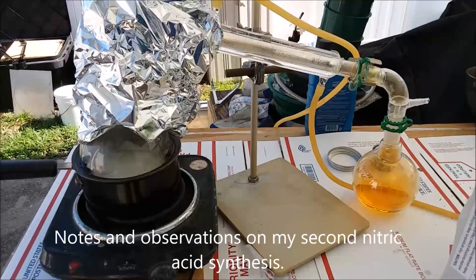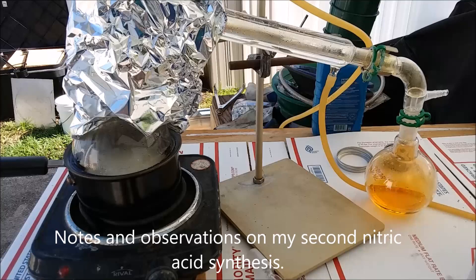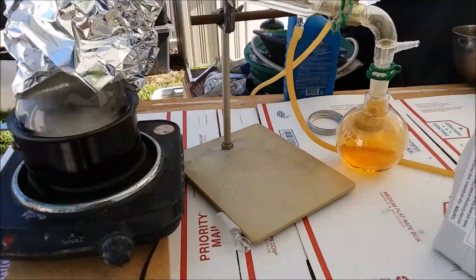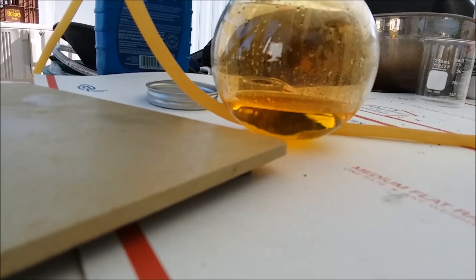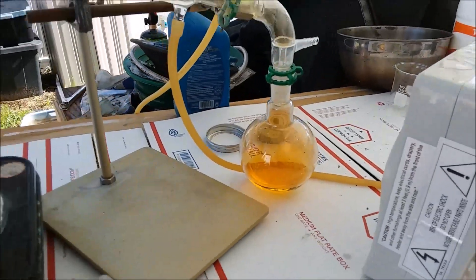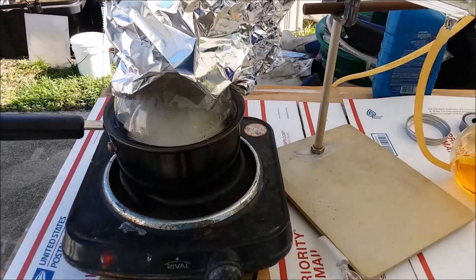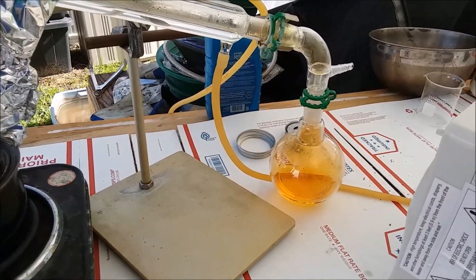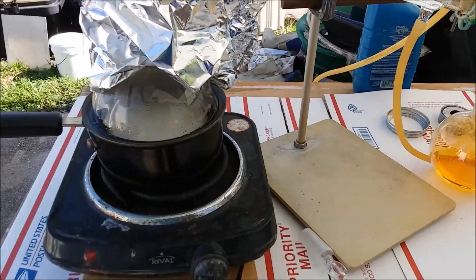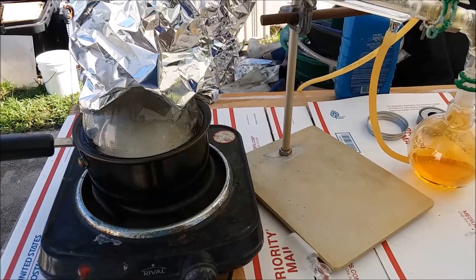I'm not sure what I did especially right this time, but this particular run of nitric acid synthesis I seem to have gotten a much better yield even though I started with the same amount of reactants. I'm not sure what's going on. I am running it a little longer than before but I'm not getting much more over — it's just a drop every few seconds. I don't know why I'm doing so much better this time.